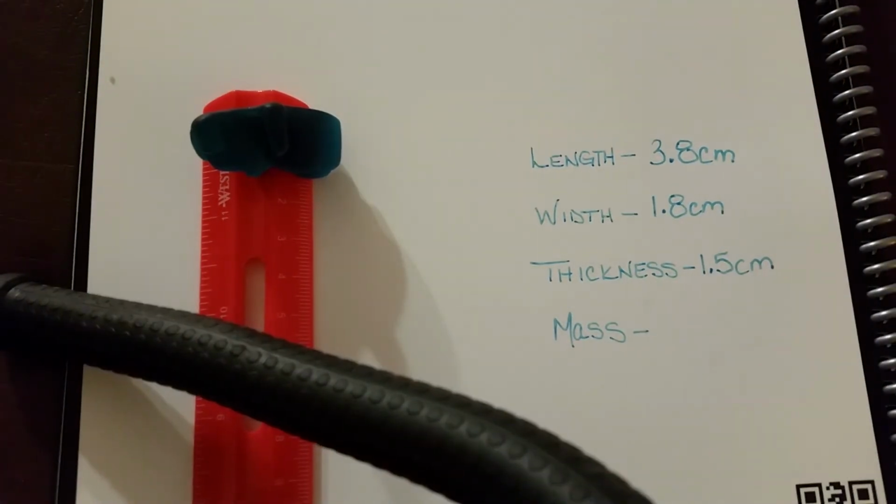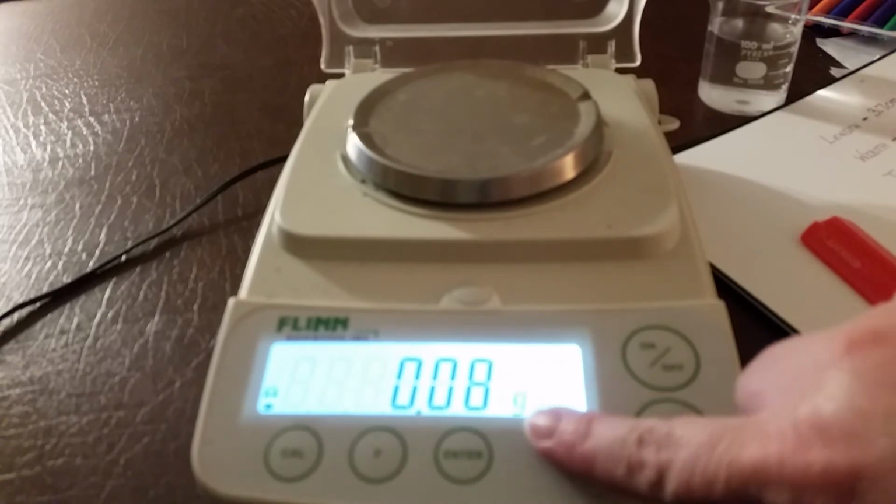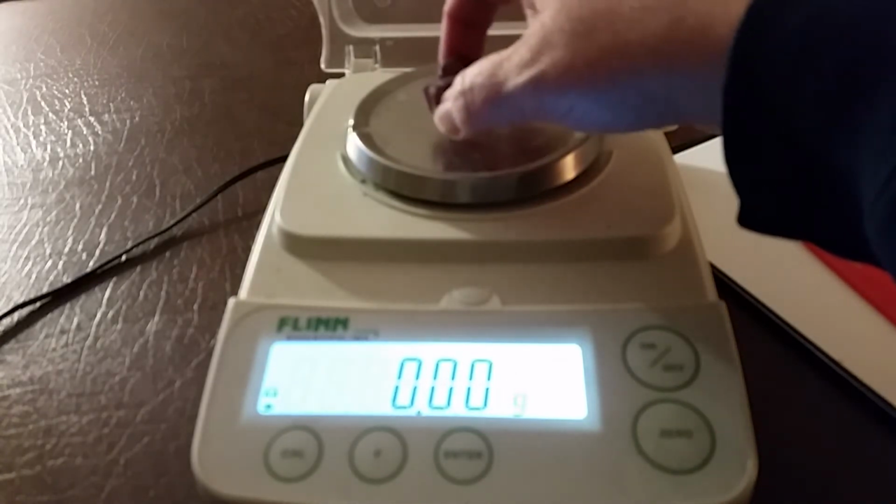All right, now I'm going to set up the balance, and we're going to get the mass of both of our gummy bears. Okay, this is a balance, and it's going to get us our mass. As you can see here, the unit is grams. That's the unit for mass. And the first thing you do when you use a balance is you zero it, so it says 0. The first bear we're going to weigh is the purple bear.